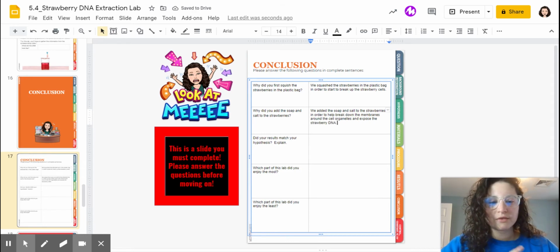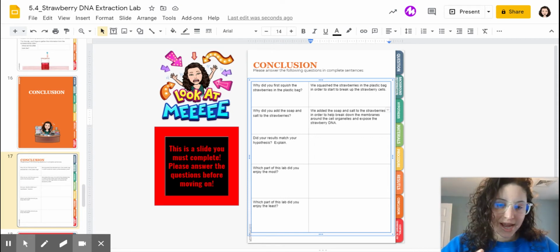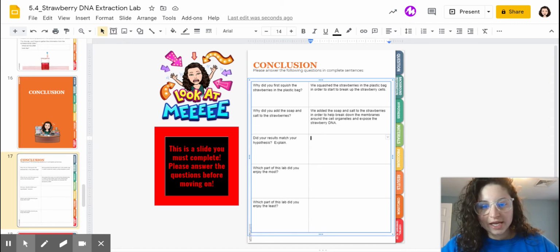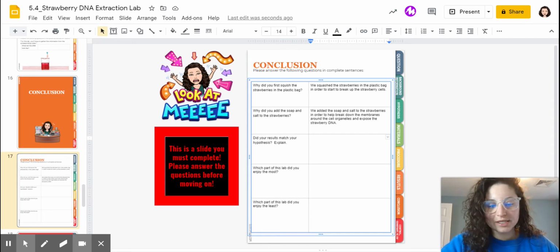So basically, we first broke open the strawberry cells, but then because this is a eukaryotic cell, there are cell organelles inside of that cell. We had to break down those cell organelles so that we could get inside of a specific organelle, the nucleus, to get the DNA. So did your results match your hypothesis? Explain. So basically, whatever you predicted the DNA to look like, did the DNA end up looking the way you thought it would? Yes or no, and explain some of the differences or similarities. So you are going to have to fill that question in on your own because you made your own hypothesis.